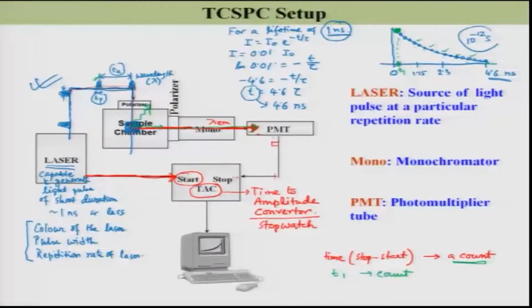Then the situation is just like before excitation, all the molecules are now in the ground state. So now what will I do? I will use the next excitation pulse, let us say the next one like here. This will come and again excite, and again this light pulse will take all the molecules from the ground state to the excited state.